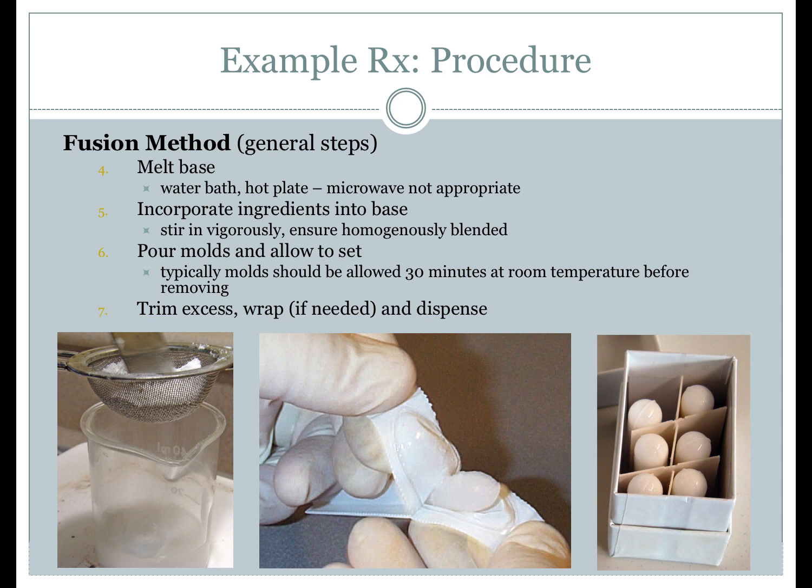When the bottom of the beaker can be left on your palm without discomfort, meaning it is warm but not hot enough to hurt, the base is cool enough to pour. Next, carefully begin to pour the base into the shells. Plastic shells need to be filled to the top. Remember, molds typically have to be overfilled to allow for the contraction that occurs as the base cools.